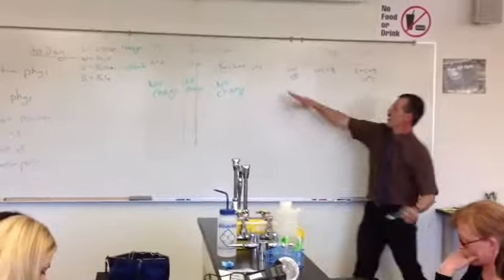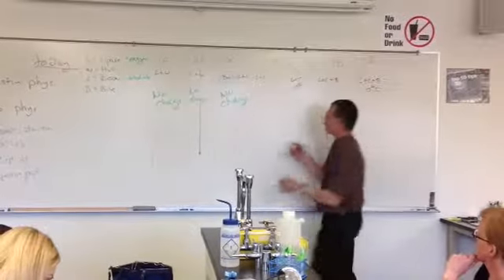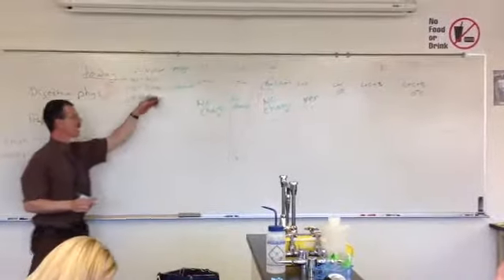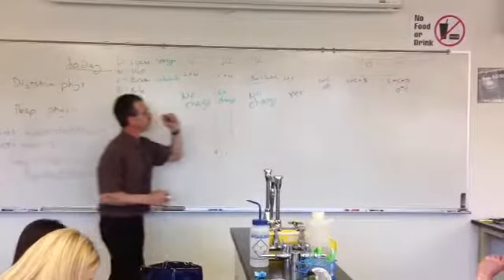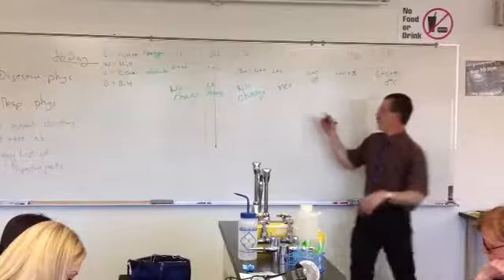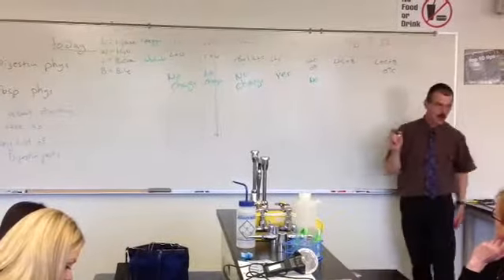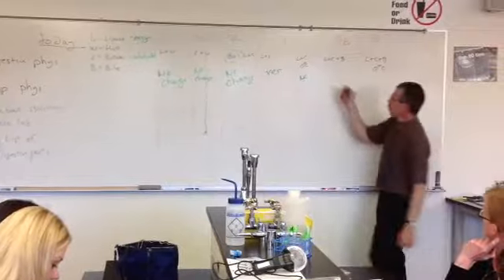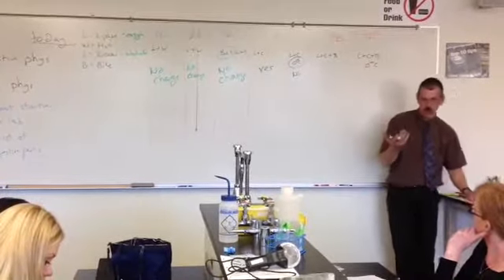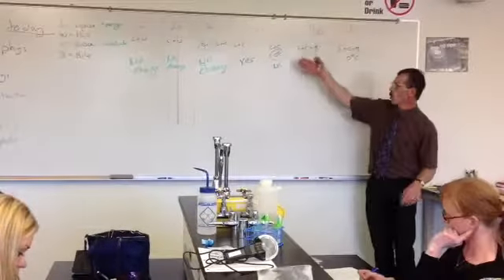Okay, so 4L. Did you get a reaction? Yes, because I have enzyme and substrate at the right temperature. Did you get one in 5L? No. Well, wait, I have enzyme and substrate. What's different about 5L? Too cold. I learned that in 112 as well. If you freeze an enzyme, it doesn't function. You didn't denature it, you just froze it. So it's too cold to operate.